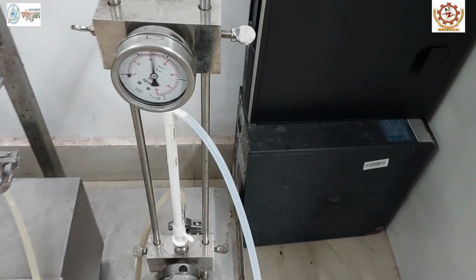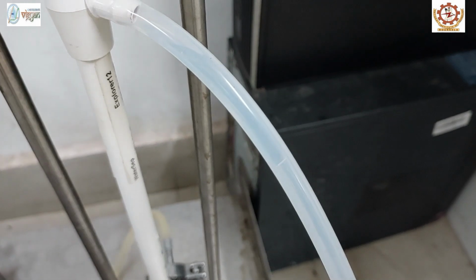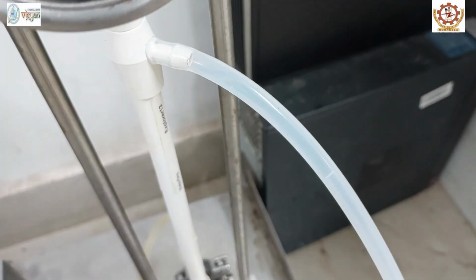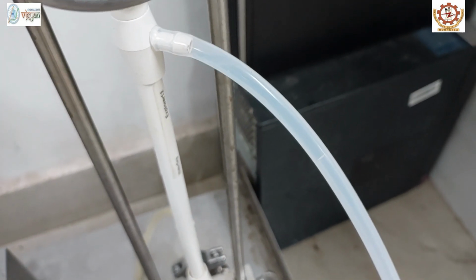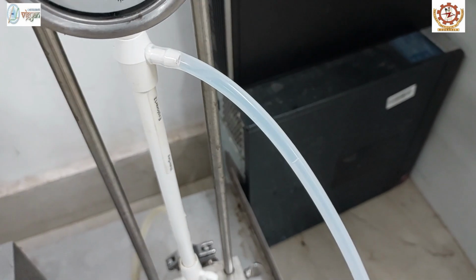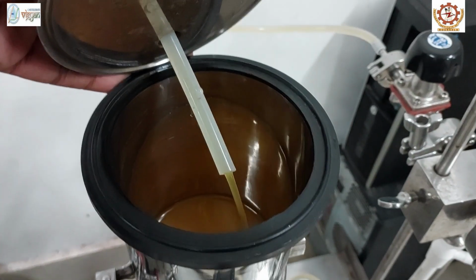Now you can see the clarified juice started coming through the outlet of the membrane. This is the permeate of the membrane, and the retentate is flowing back to the feed tank.